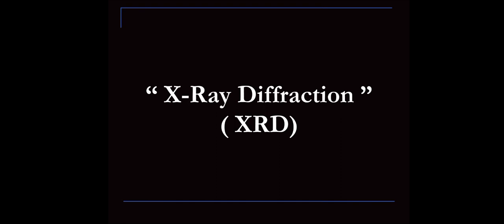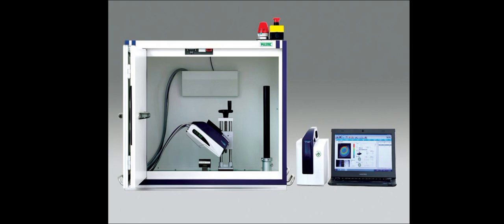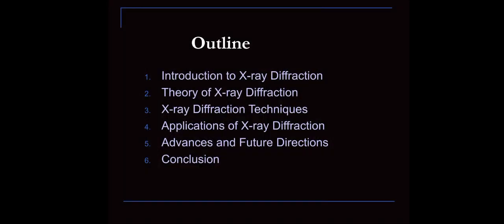Today I'm here to present my presentation, and my presentation topic is X-ray diffraction. This is a diagram of X-ray diffraction. Now I will discuss the basic outline of X-ray diffraction.